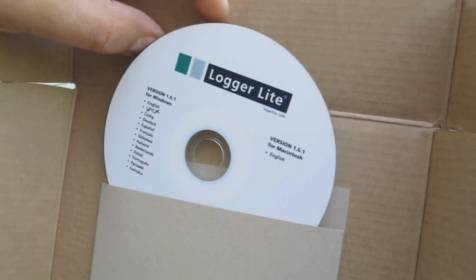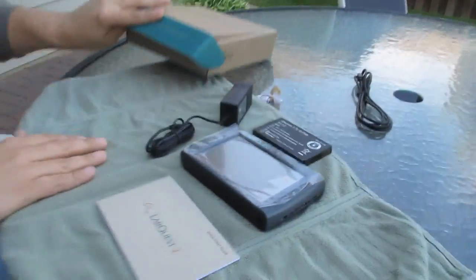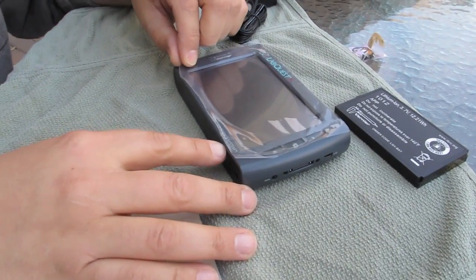It'll work with Logger Pro, but you have to get the update — like version 3.8 something. Set that aside. So if you have Logger Pro at school, you'll need to update it to work with the LabQuest 2, or install Logger Lite.